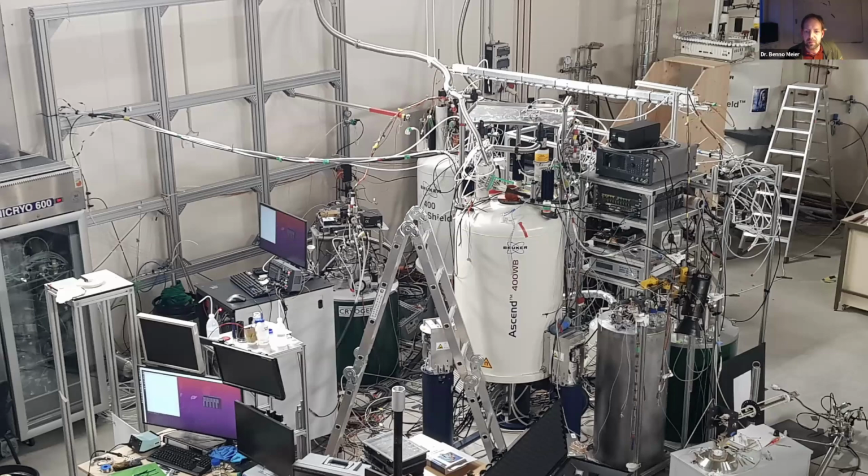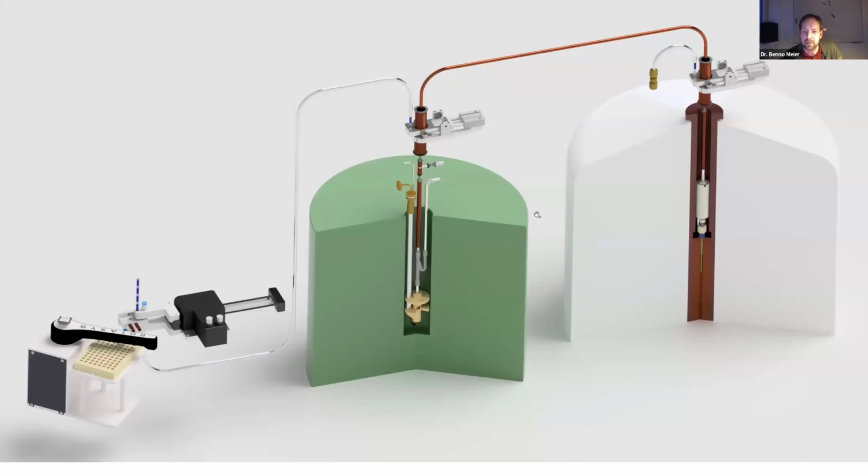Okay, so here is a render that Masoud prepared of this machine. And the new thing, let's say, is here on the left. This is what sits in the fridge. So you can see here, there is a moving arm and there is a tube. And in this tube, you have bullets. And so the first step is that this arm moves forward such that one of these bullets can drop into this little hole here.